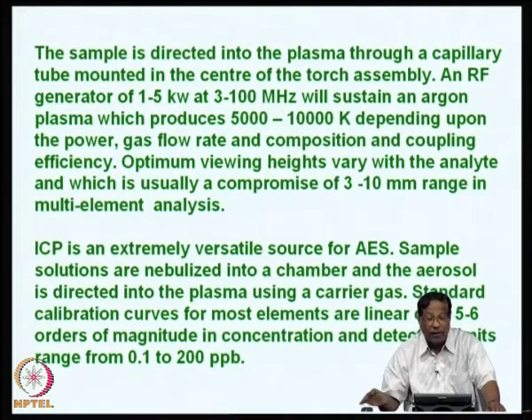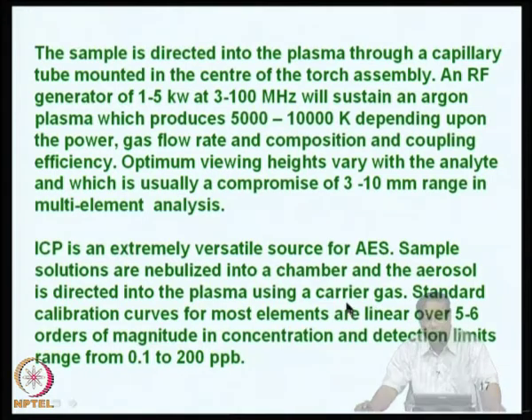So, argon serves number of functions. One is it generates the plasma, it acts as the secondary coil and it introduces the sample. It also cools the torch ends.